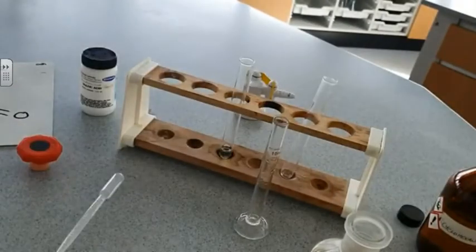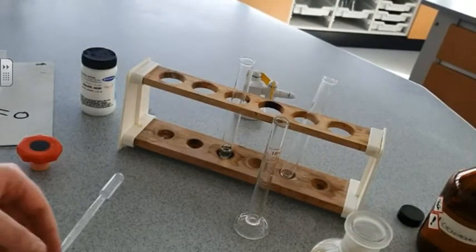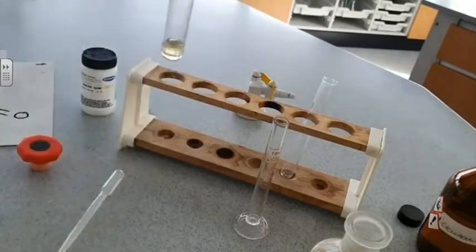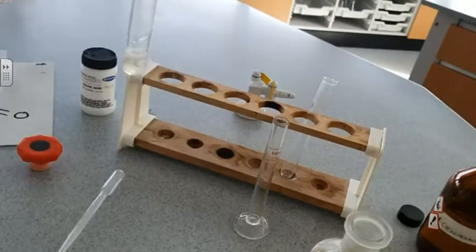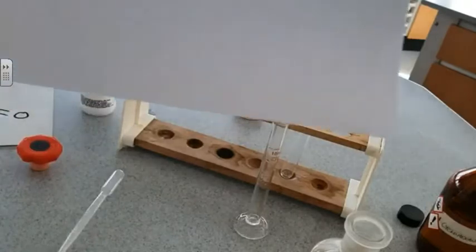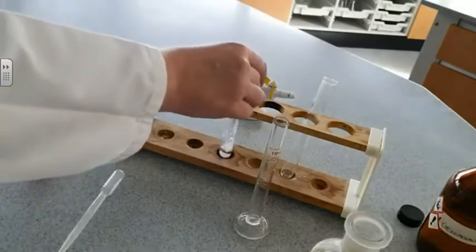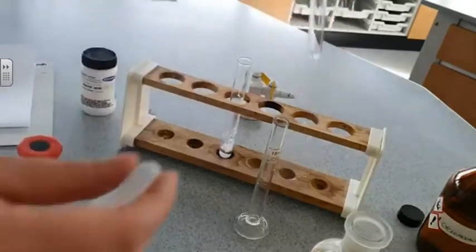What we're going to do is place a small amount of maleic acid into the test tube with the bromine water. There we go. And give it a little shake. We can see that the orange colour has disappeared. It's very difficult to see, but there is nothing in that test tube of any colour. The white bits are just unreacted bits of maleic acid.